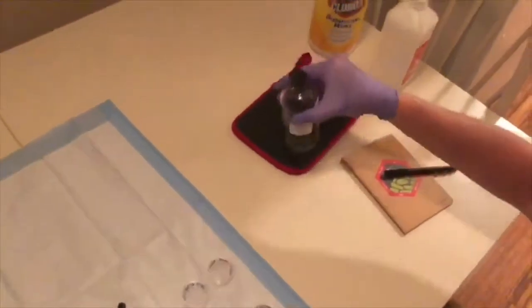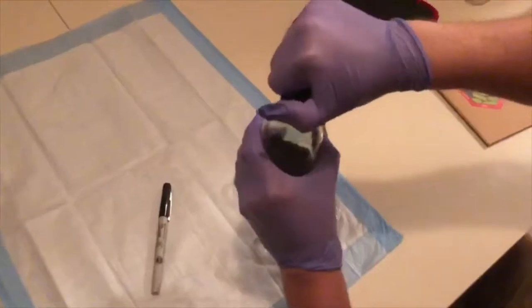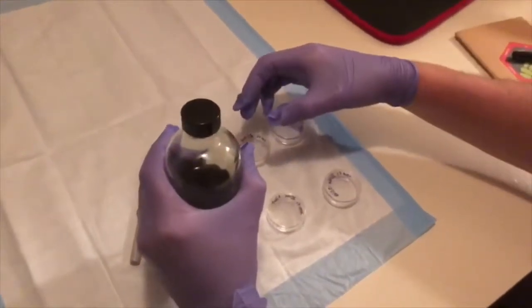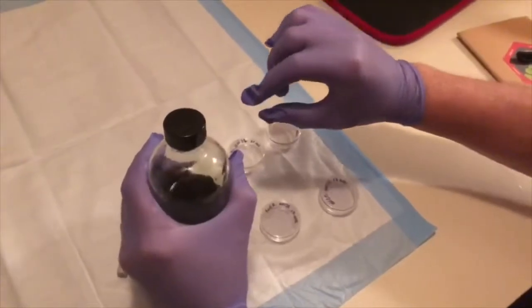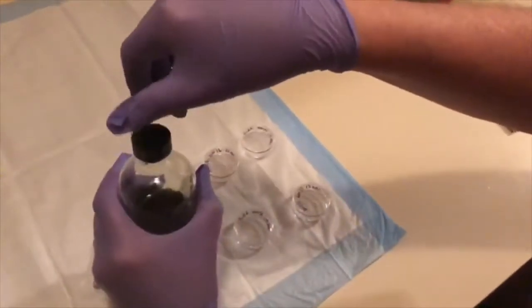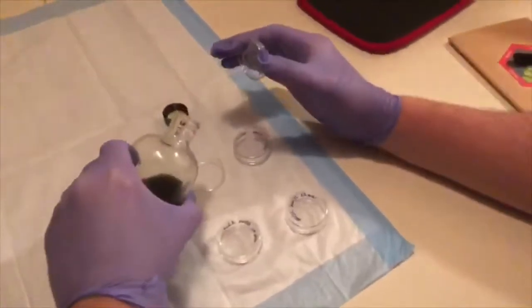So my media, remember, I need to swirl it to make sure that everything is in suspension. I'm going to use my dominant hand for pouring. I'm going to loosen the cap, okay? And I'm going to lift the lid just enough to be able to pour the media in there. I'm going to pour it up to that knurled edge on the base, which will be about 1 or 2 millimeters from the lip of the plate. So I'm placing my cap up so I don't contaminate the edges, and gently pour.